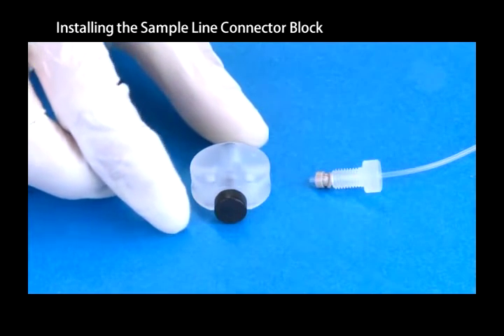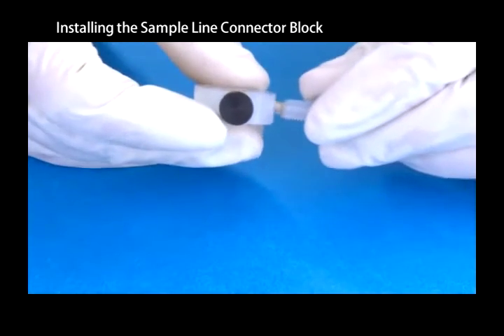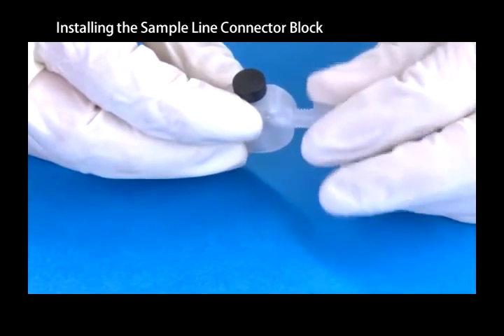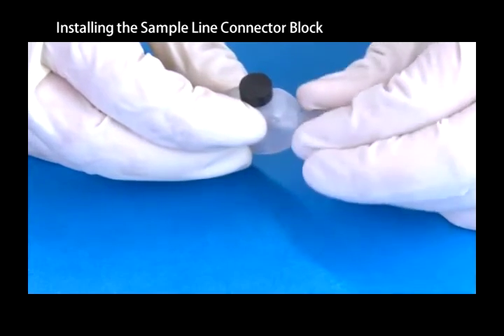Fully insert the end of the tubing into the connector block. To reduce the amount of dead volume, keep the tubing pushed in as far as possible while tightening the nut.